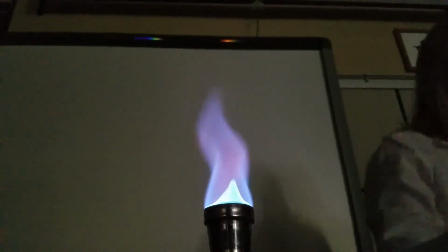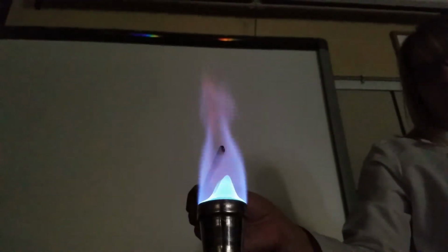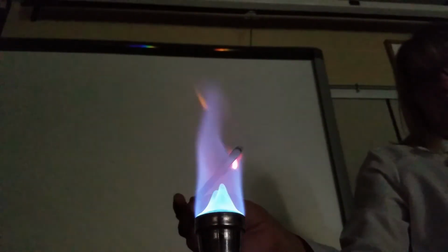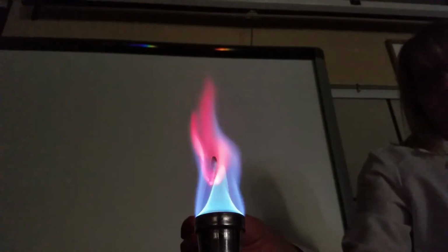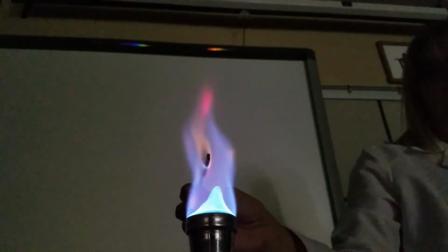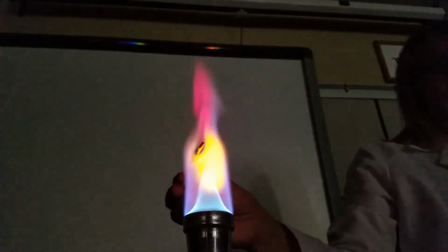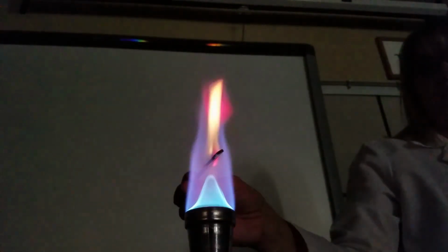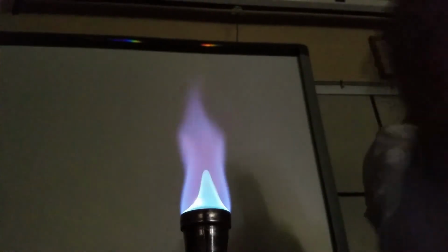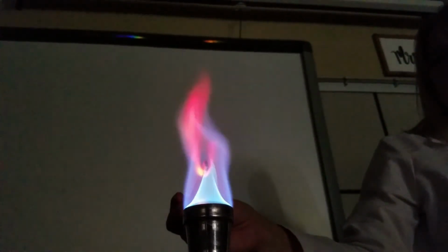And then finally we have strontium chloride. Look at that. You can tell that it's kind of similar to some that we've seen earlier, so be descriptive instead of just saying red. Kind of describe that color exactly. That one kind of burned out a little. Let me do one more little strontium for you so you can see.